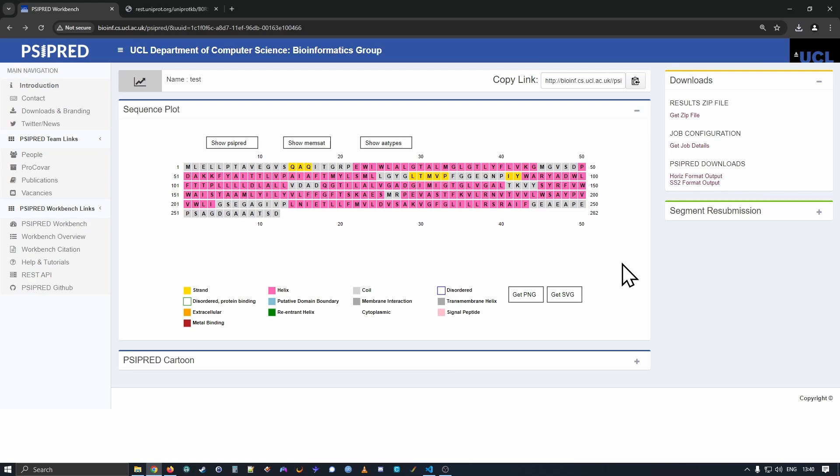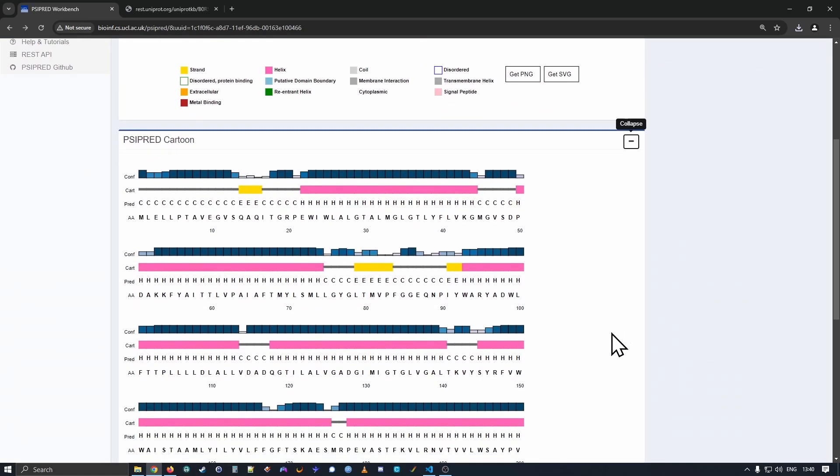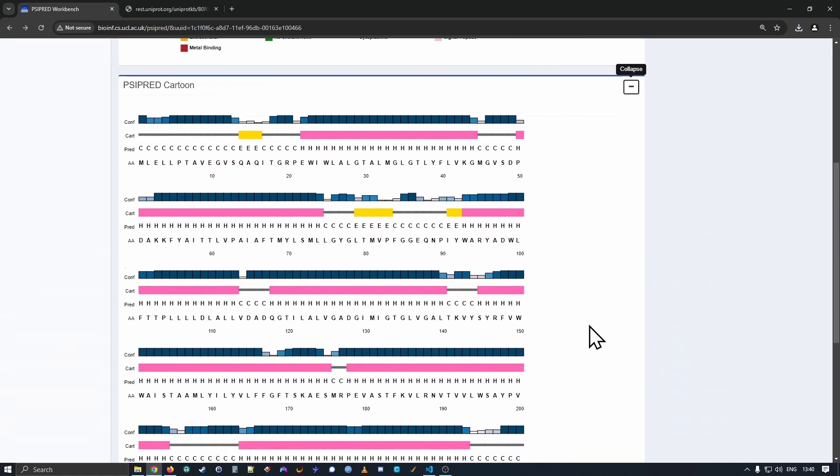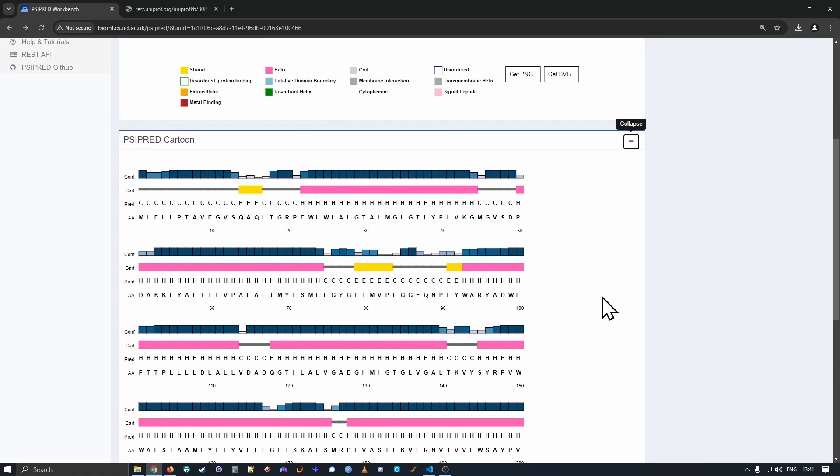Many of our methods produce other diagrams and other details. Below the sequence plot area, we have other panels that you can open up. Cypred produces what we call our Cypred cartoon. This just kind of repeats the information you've just seen, just laid out in a different format.